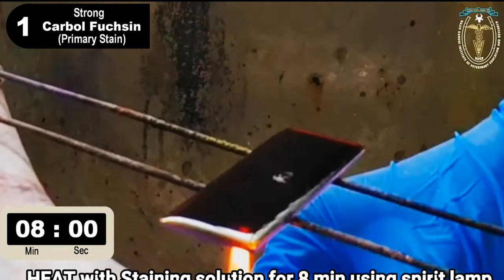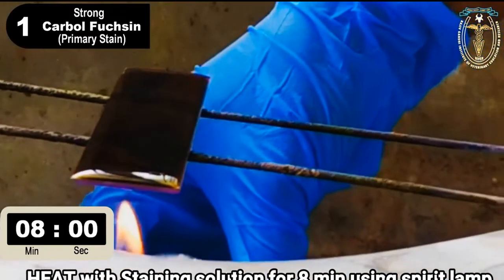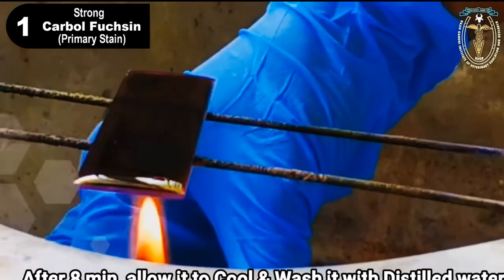After 8 minutes, allow the slide to cool down, and then wash it with the distilled water. Distilled water ang nakita ko nga term kayo na.